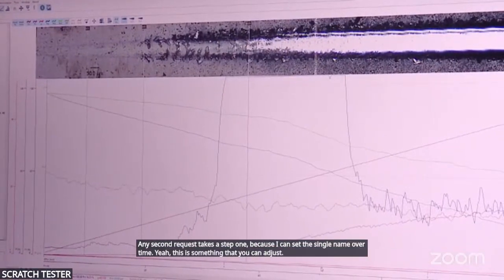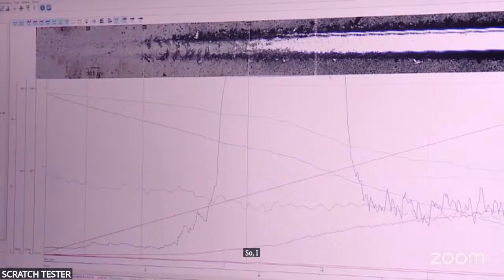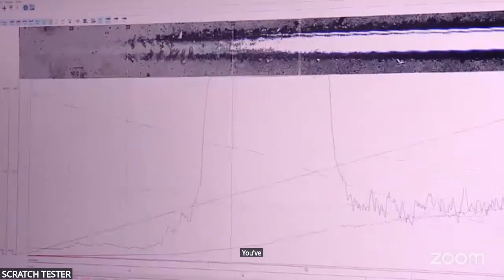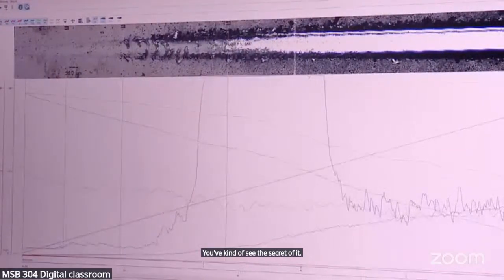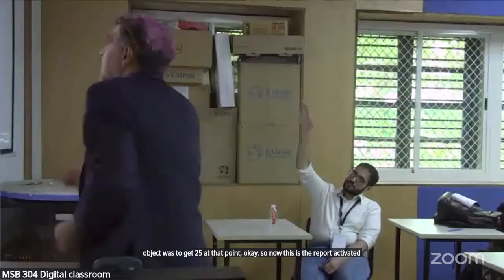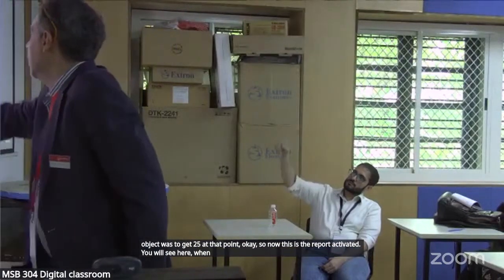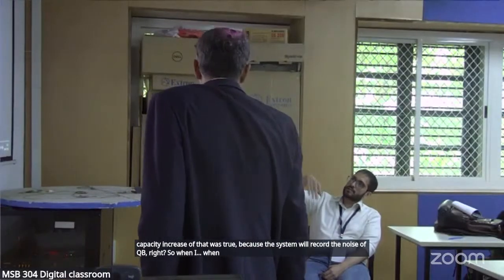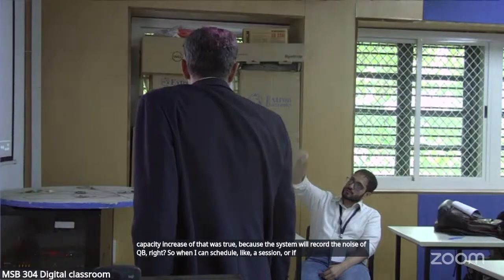Yeah, this is something that you can adjust. I have selected 7 to be able to show you that when you have chipping, you can see the increase of the acoustic emission set point. This is important. When you start to see the chipping, you can see the increase of the acoustic signal, because the system will record the noise of chipping. So you can set it like a set point.